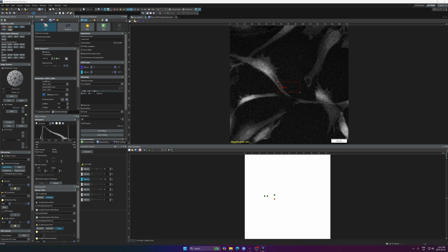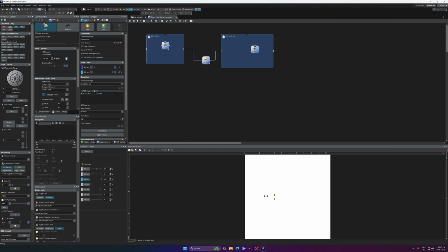So in order to do FRAP, basically this is the experiment that you can do. And I'm going to change this back to green spinning disk, because in this slide, apply the setting. And the same thing, I'm going to change this to green fluorescent protein. That's basically the imaging condition. I will do 200 milliseconds. I think that's my exposure time.